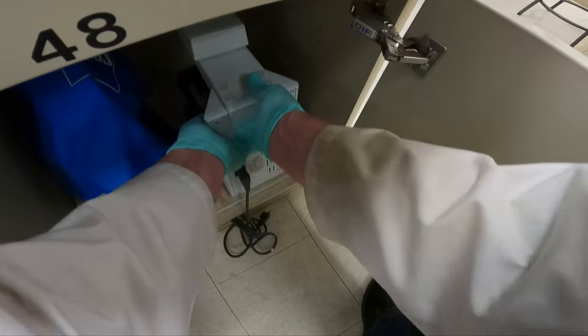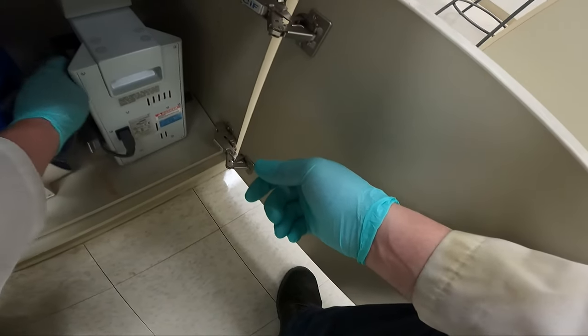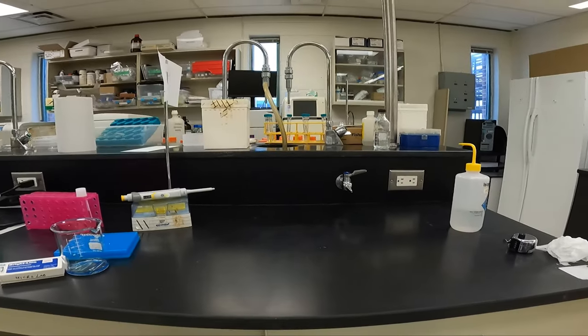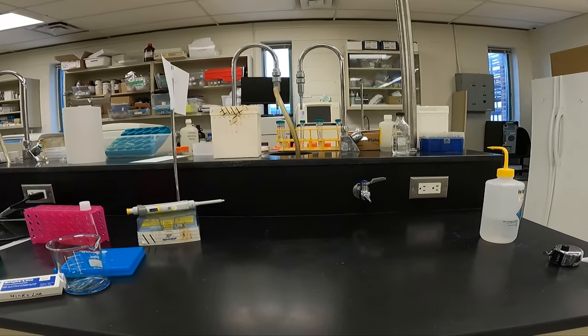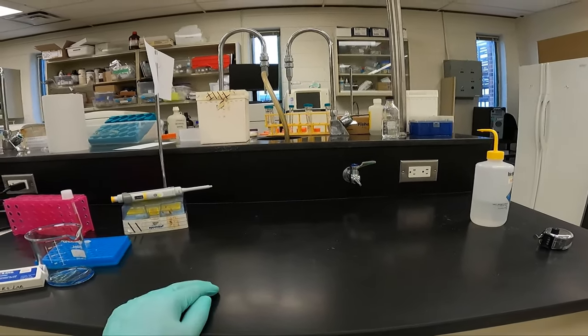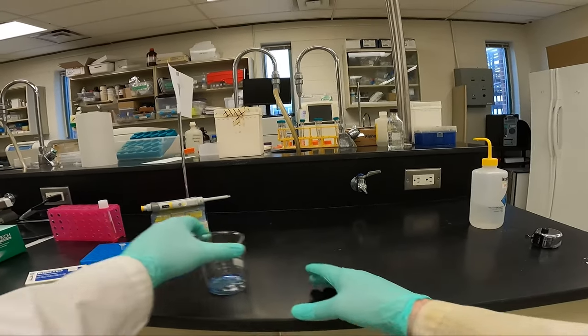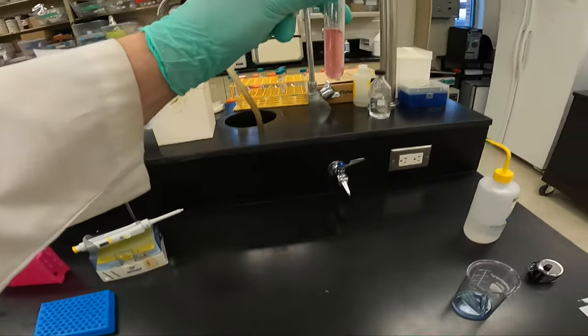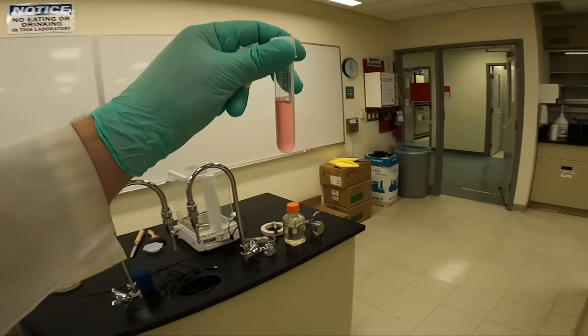So in today's lab, we looked at how to count cells using a hemocytometer and a compound microscope. We did the calculations to determine the concentration and the percent viability. We have our leftover cells. Please remember to bleach them when you're done. That's all for today.